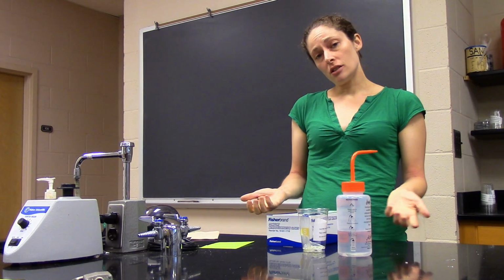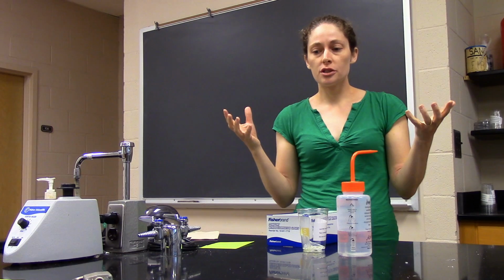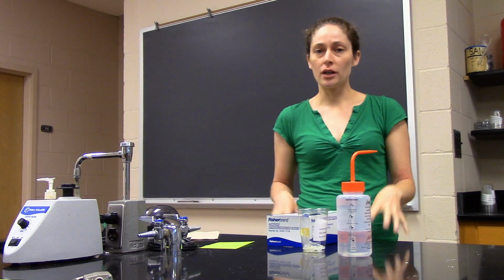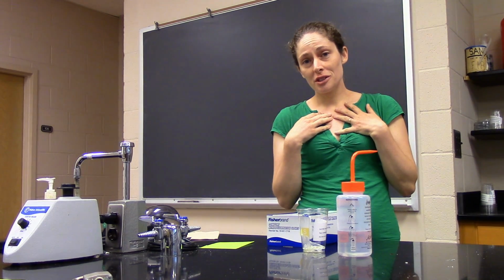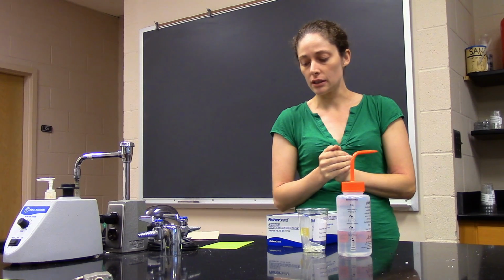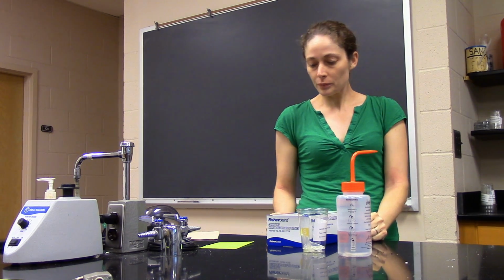So where can contamination come from? Unfortunately, the answer is pretty much anywhere and everywhere. In the air, there can be bacteria and fungal spores floating and coming down and landing on your work area. All the surfaces, like the benches, you can also assume are contaminated. We are a source of contamination, so the hands that we use to do our experiments might carry viruses, bacteria, as well as our own skin cells. And as I'm talking, all the bacteria from my mouth are coming out, going into the air, and could also come down and land on my experiment.